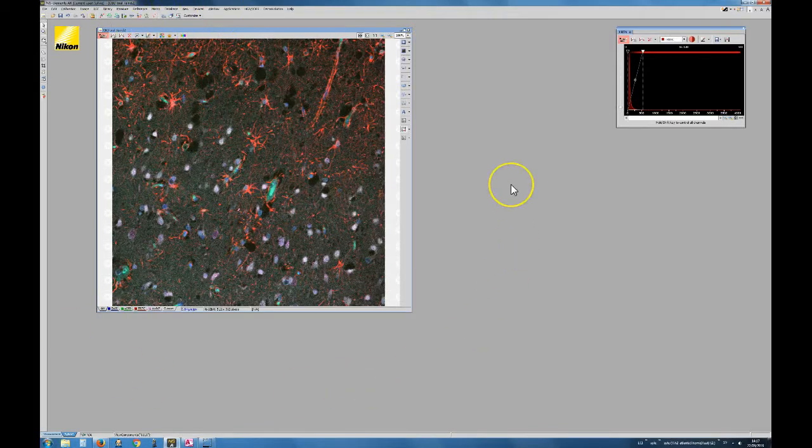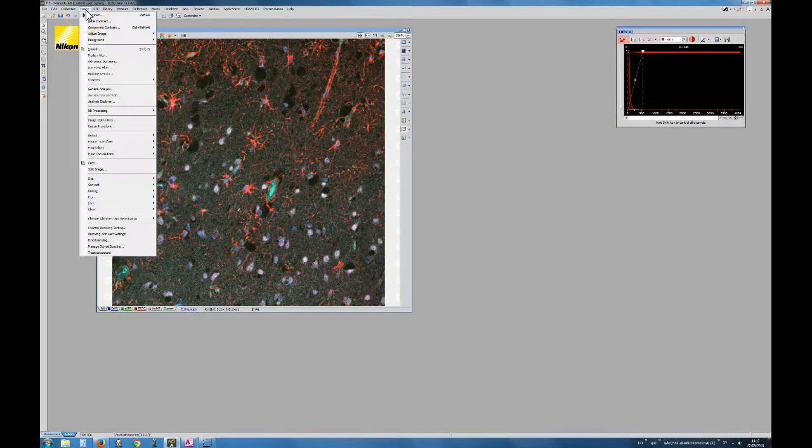So to analyze this data, what we're going to do first, and we have a lot of images that we will analyze in the same way, is open something called general analysis. If we go under image, we can see here we have 2 different things. One of them is the general analysis, the other one is analysis explorer. Once we have some general analysis saved, we can use the analysis explorer to go back there.